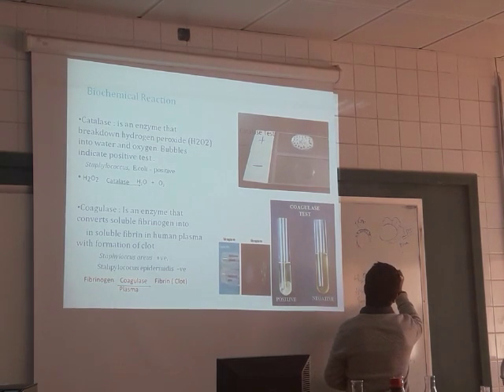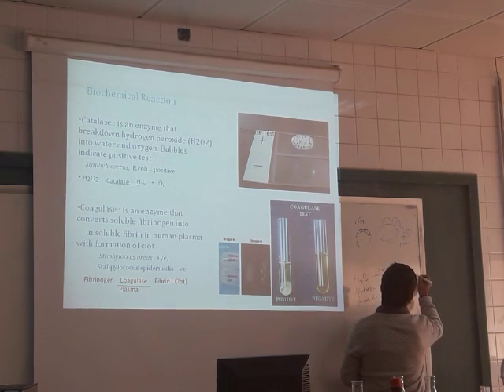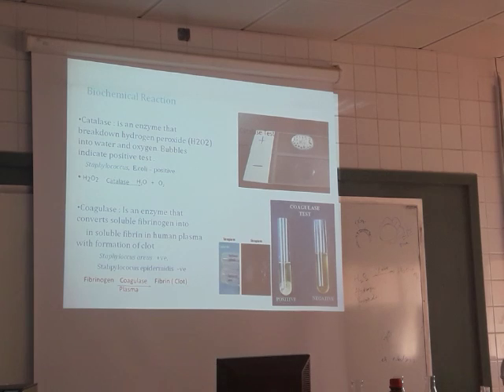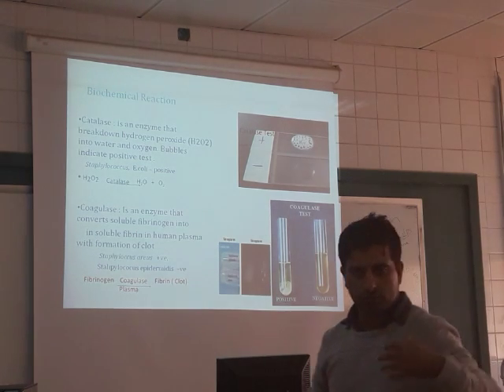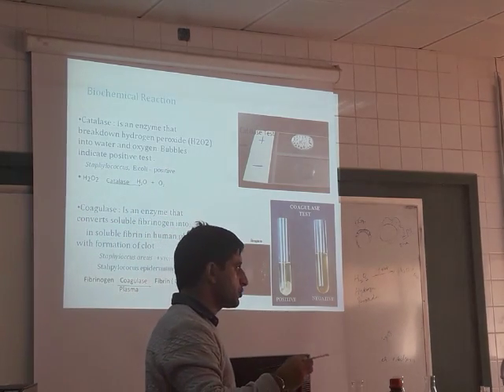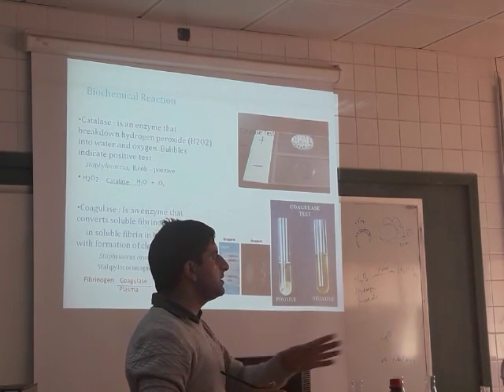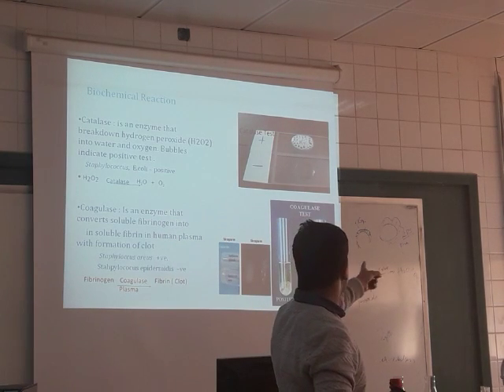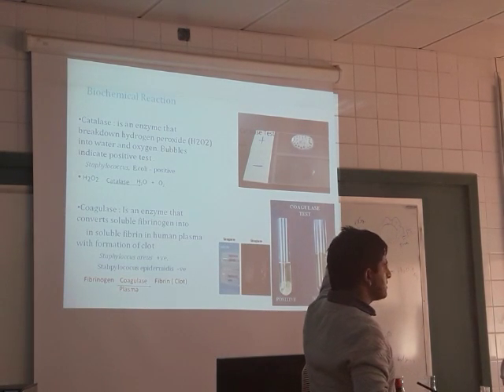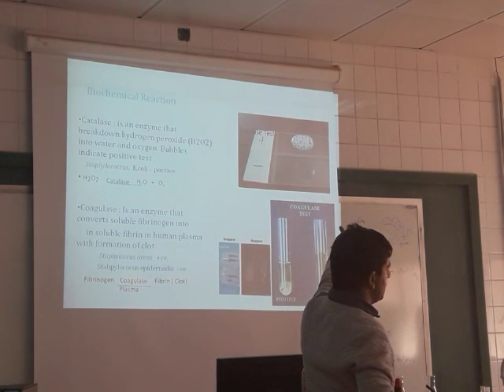And if the bacteria have the enzyme catalase, it breaks hydrogen peroxide down into water and oxygen. So in our body, if there is an infection of bacteria, the body cell releases hydrogen peroxide to kill that microbe. If the microbe has this enzyme, it releases it immediately to destroy the hydrogen peroxide, in the form of water and oxygen. If you see bubbles, it is positive. The second is negative, which means the microbe does not have the enzyme catalase.